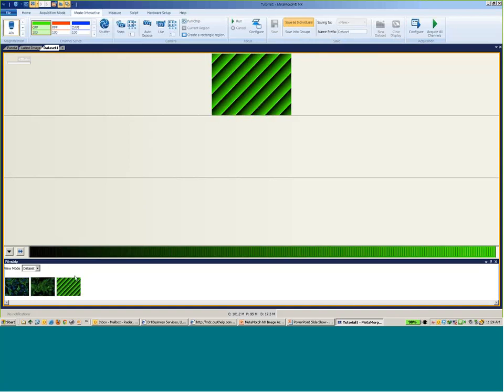Then the final mode is our target illumination. So this has a left to right workflow. Again, selecting the magnification setting, we can do some snaps for that. We can come in and do the acquisition we're wanting for the wavelength. And then additionally, for some of these options to actually show up and be able to utilize, you have to do the calibration initially. So when you click on the calibration, it has more or less a wizard, a step approach for your configurations.